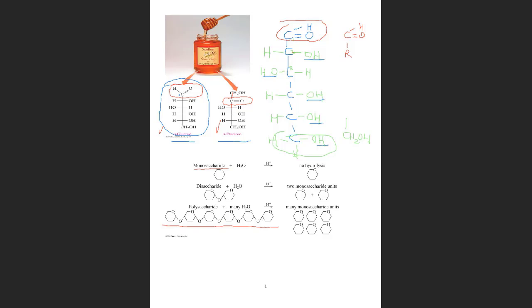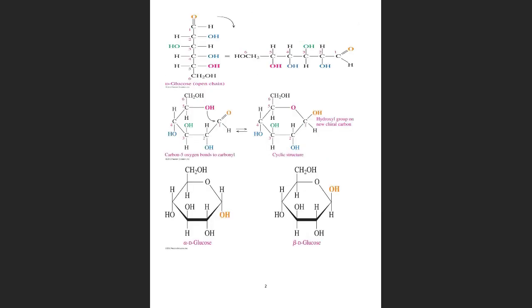So we are going to perform 4 tests mainly. The first test is the Benedict's test. The Benedict's test is used to identify simple reducing sugars. Reducing sugars have an aldehyde that can reduce other compounds. Let's look here.